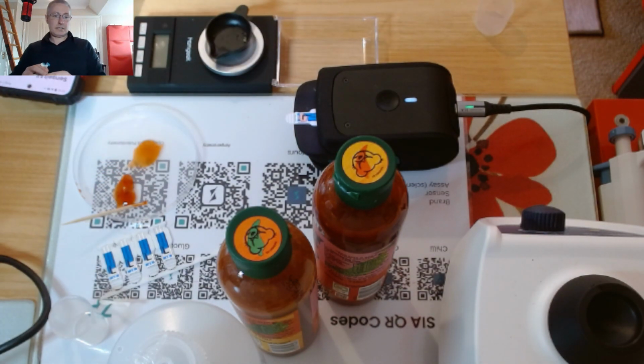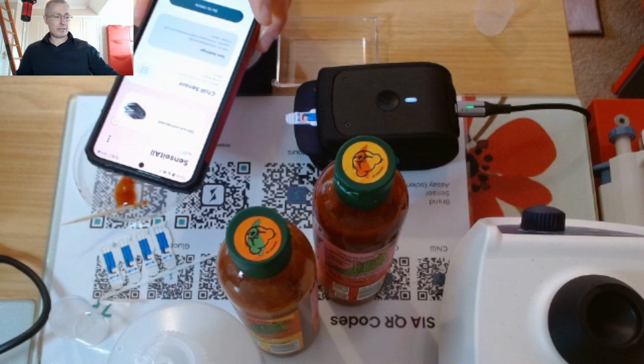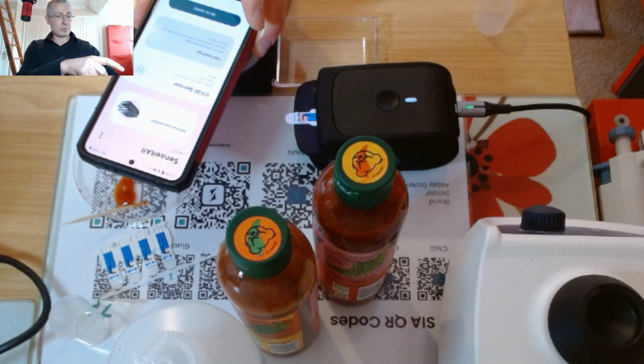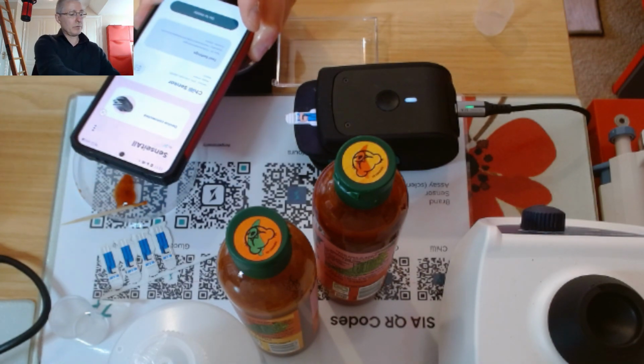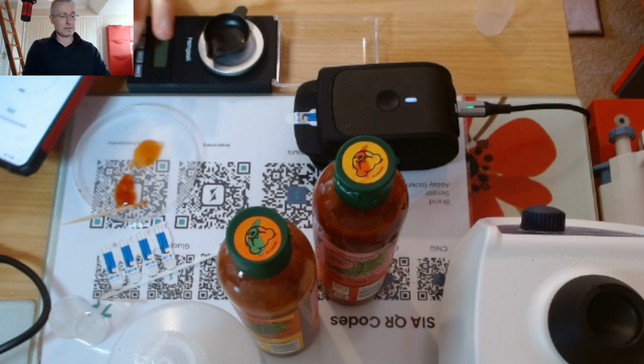I haven't really mentioned this too much, but I should have. There's an app on my phone that is part of the Food Sense Generation 4. The app is in Bluetooth connection with the meter. I have given this sample a name, and what I will now do is go to assay and start the measurement and let that progress.